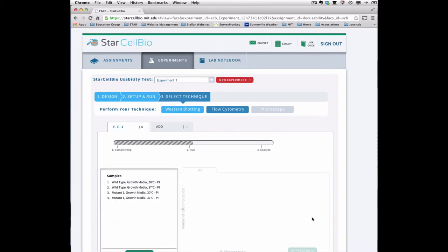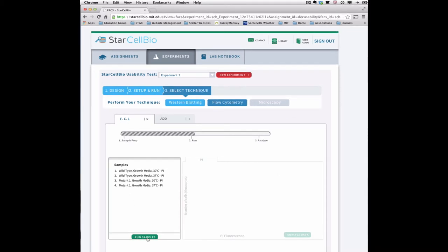A list of all your samples for flow cytometry is contained within the Samples window. To run the samples through the flow cytometer, click Run Samples.